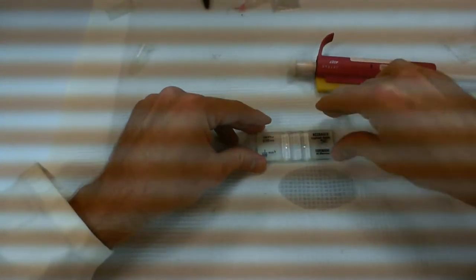Now that I have a bit of moisture there, I'm going to put a cover slip on there. So let me just get rid of this tip. So here's my cover slip. I'm going to put it on top.